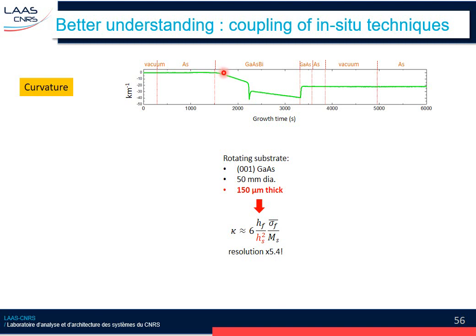During this growth on this very thin wafer, we see the delay, so the bismuth segregation, a first slope, then a huge transition signature, and then a second slope. At the beginning the slope is steeper, which means that more bismuth is incorporating in this regime, and then the slope is less steep, and there is less bismuth incorporating in this region.